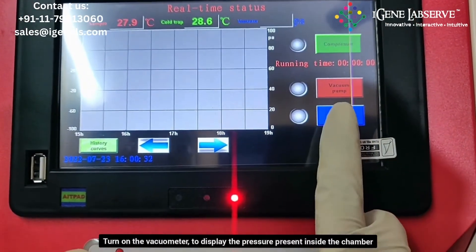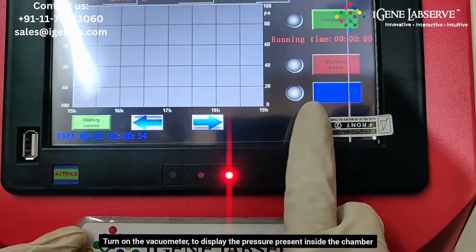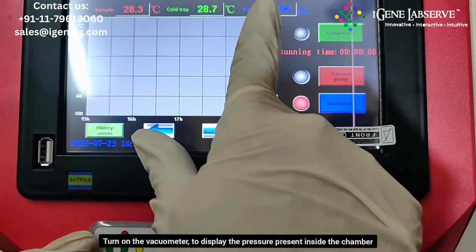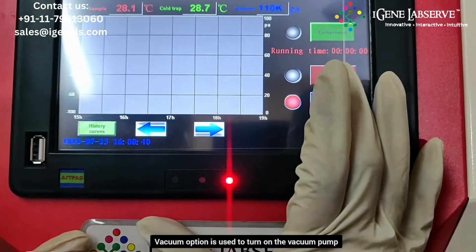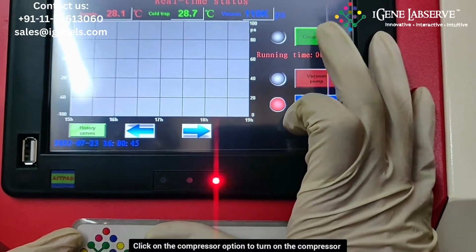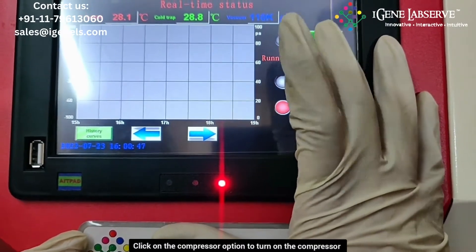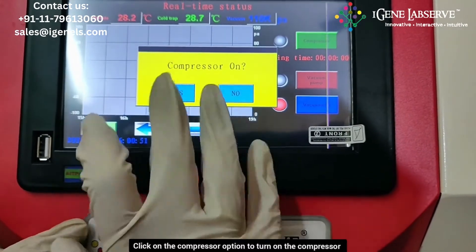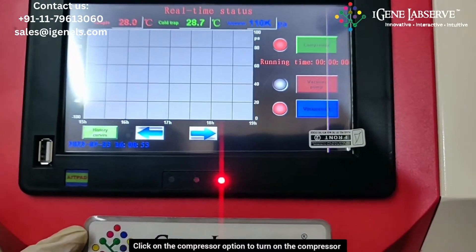To visualize the pressure, you have to turn on the vacuum meter using this. It displays the pressure. This is for turning on the vacuum pump, and this particular option is for turning on the compressor. To turn on the compressor, you have to click on this and then click yes. The compressor turns on.